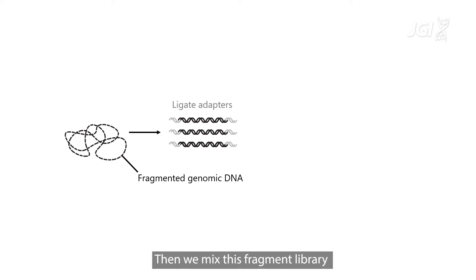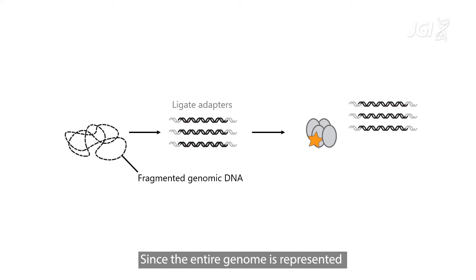Then we mix this fragment library with the transcription factor proteins that were synthesized earlier. Since the entire genome is represented within this library of fragments, some of them will contain the transcription factor's preferred binding sites.